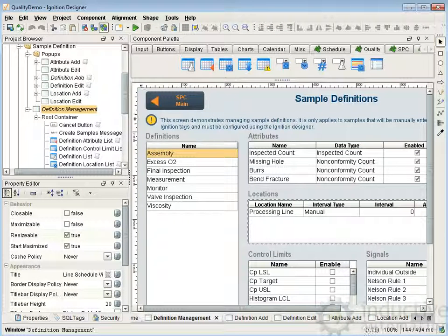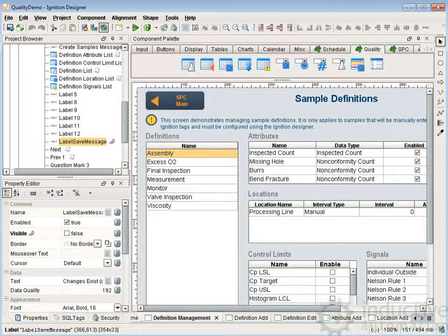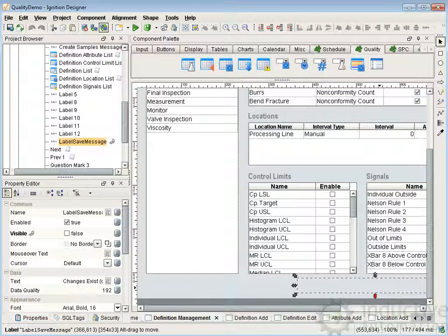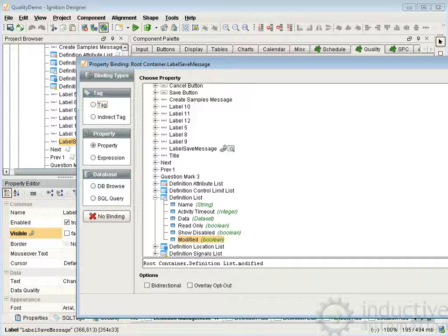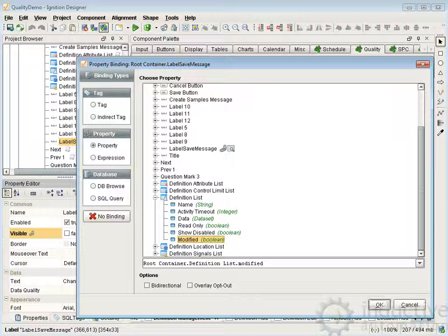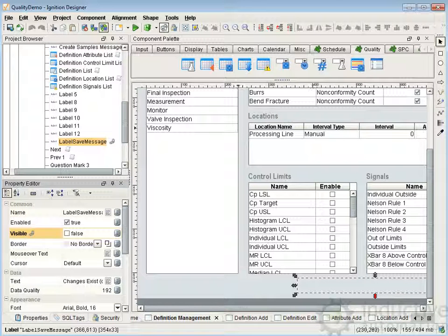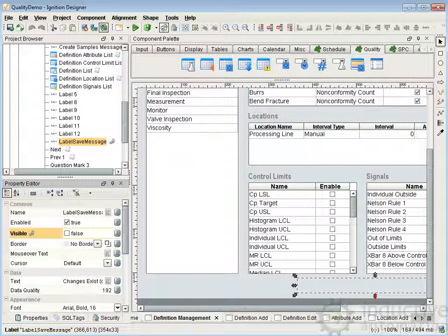On this screen we also have a label that pops up and says you should save or cancel your changes. That label appears — we go to the visibility property — it appears when the definition list modified property is true. We just bind that visibility to the definition list modified and it will appear any time there's a change made — a new definition, attribute, or what have you is added. So that gives a brief overview of how it all ties together. You can take a look at the documentation for the specific scripting functions and also refer to the demo project and take a look at how it is done.